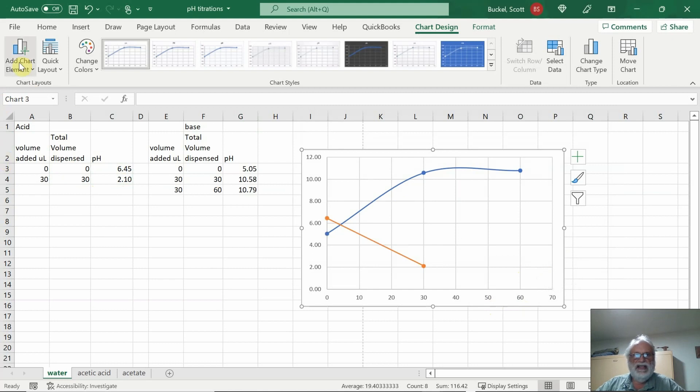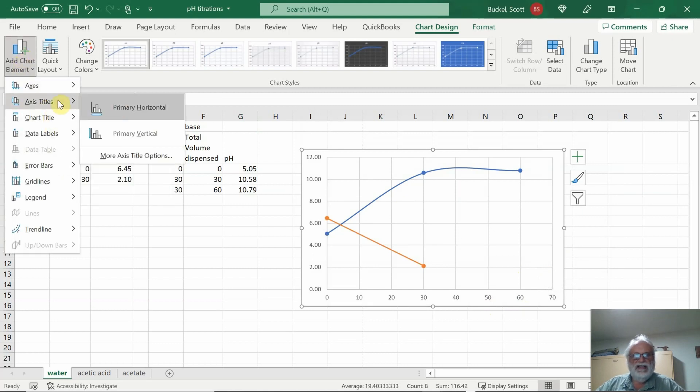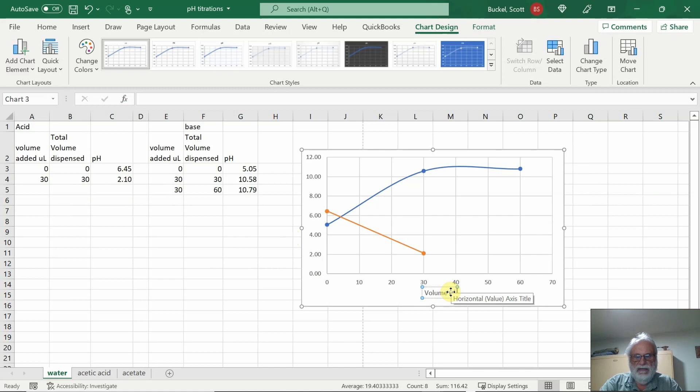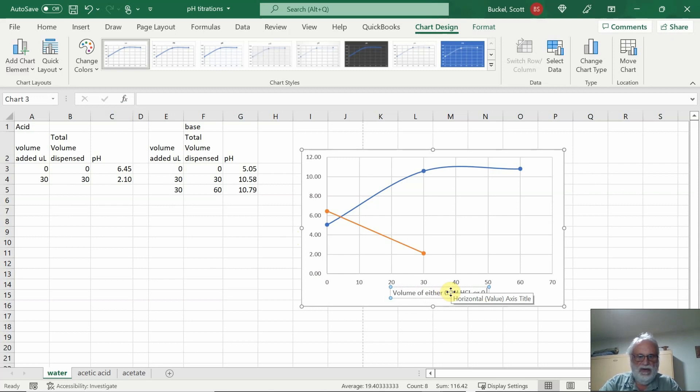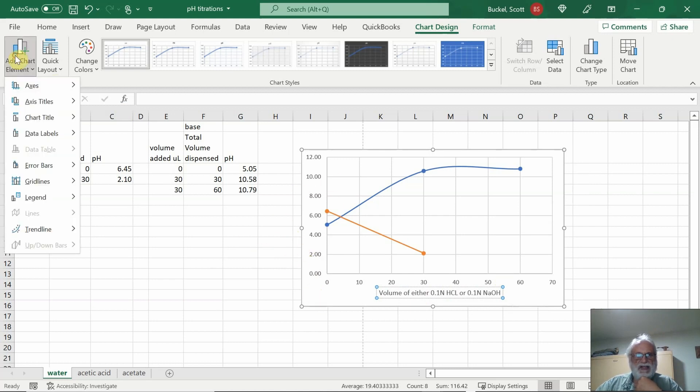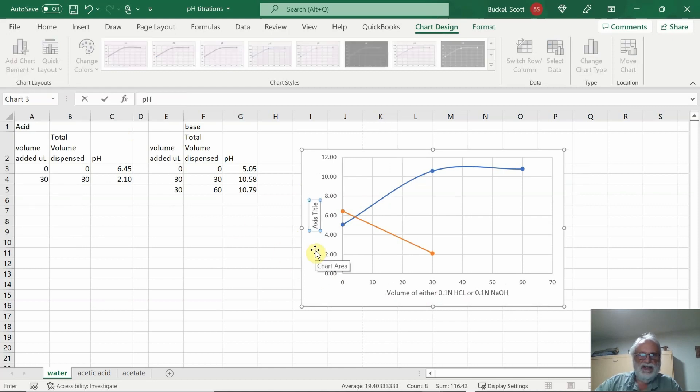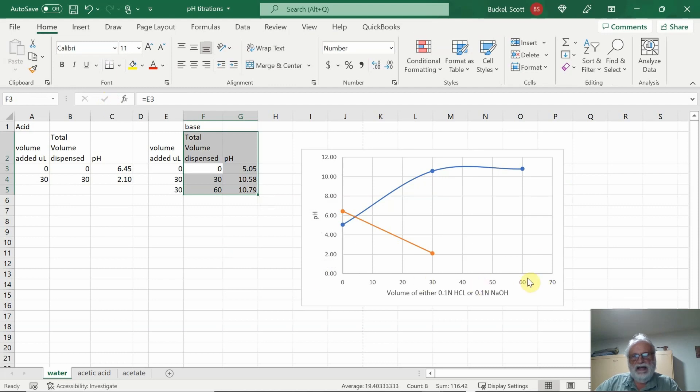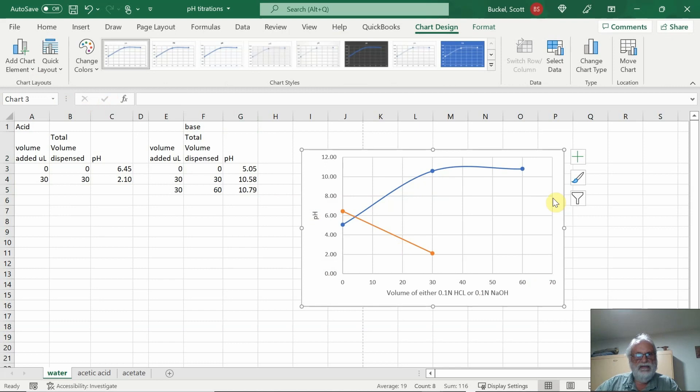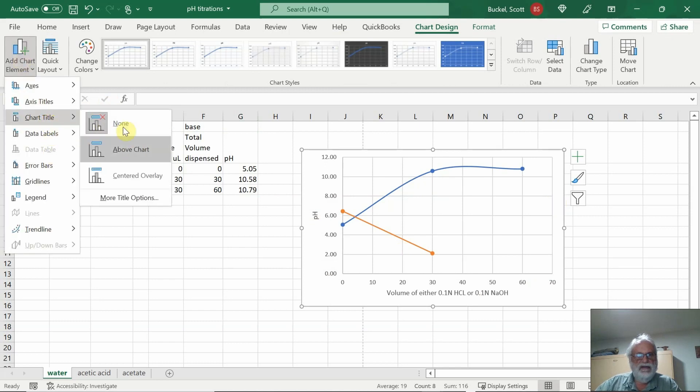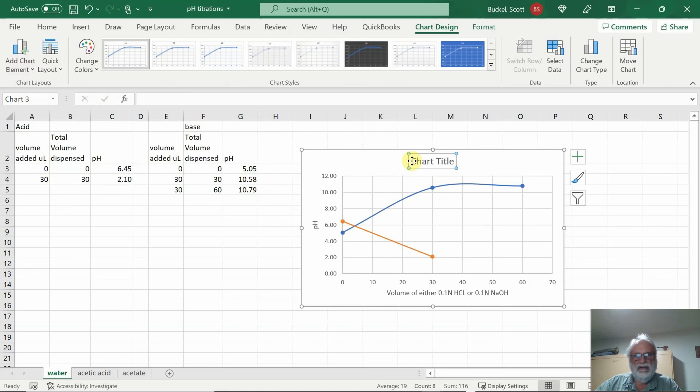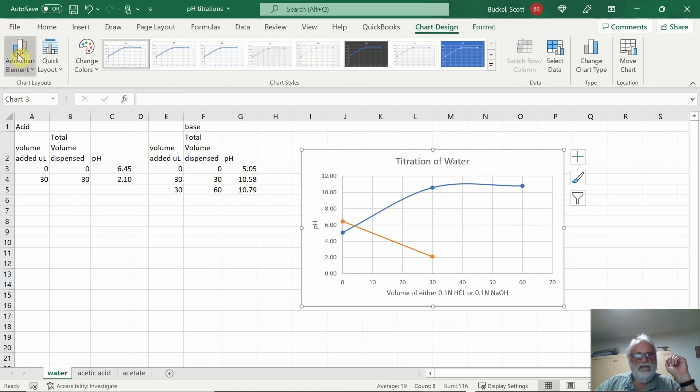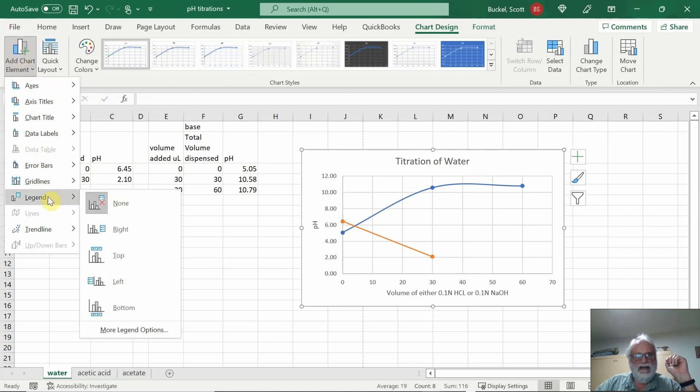Make sure you only highlight the numbers. This here and highlight these two numbers. Hit enter. So it's not particularly exciting looking. But here we go. We have the graph. You just go through all the same things again. Axis titles, horizontal. So we have that on the axis on this axis here. We'll put pH. That'd be the primary vertical. pH. And here we'll go ahead and add chart title, above chart, titration of water. And go ahead and add insert element, legend.